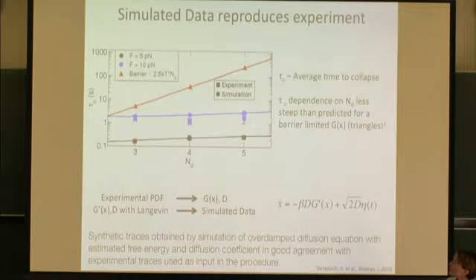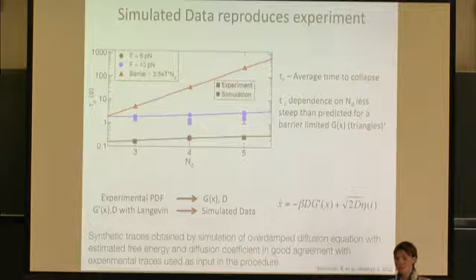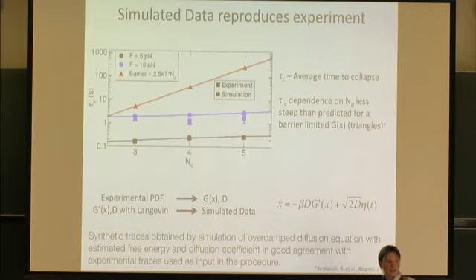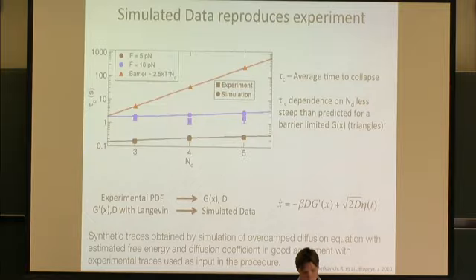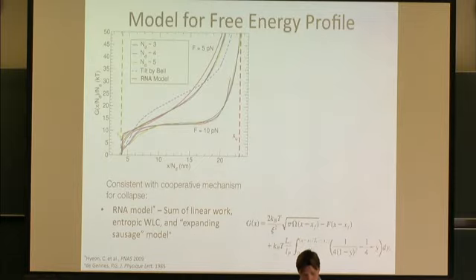And one other interesting point: if I were to ask you before I started this talk, why is this thing diffusing for so long and then collapsing cooperatively, you may have said, because there's a little barrier somewhere and it's hovering behind it, and then it collapses as it crosses. But if that were true, then there would be an exponential dependence of the time on the number of domains. The fact that the number of domains doesn't seem to affect the collapse time very much is consistent with this hovering and diffusing on a flat landscape. So we think we've discovered an alternative mechanism for the hydrophobic collapse.